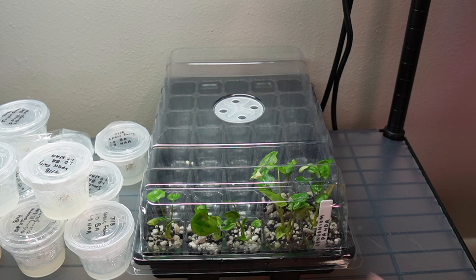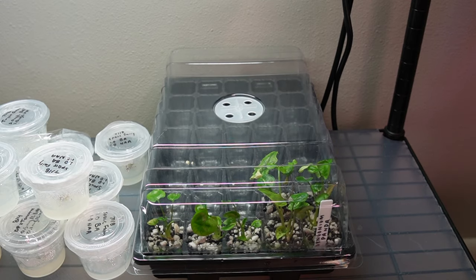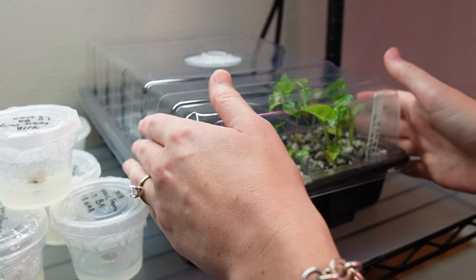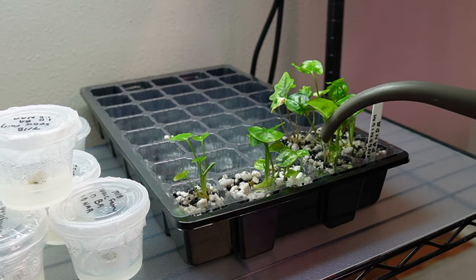For the first two weeks, you don't want to do anything. Don't look at them too closely, don't open the lid and start poking at the plants, don't do anything. After two weeks, I twist open the vent to slightly reduce the humidity inside of the tray. If the substrate is starting to dry out at this point, you may need to add some additional distilled water.